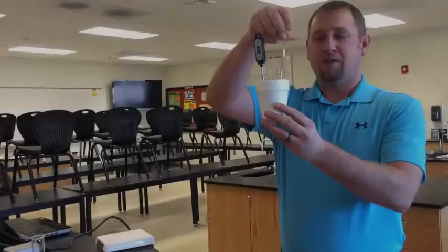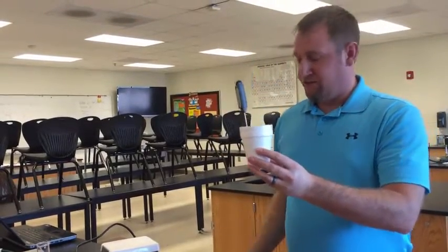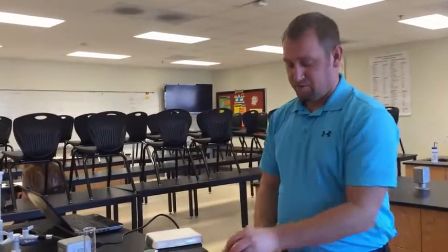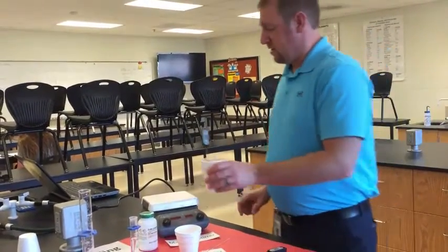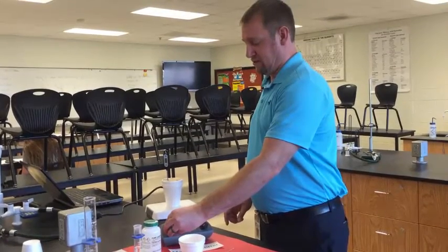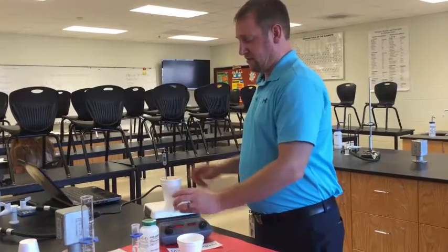Now, there is an alternative method to stirring your calorimeter rather than the old-fashioned stir stick, which we just demonstrated. You can start over using a technique you've learned before: take the magnetic stirrer, put it into the solution, reattach the cardboard top, and add the thermometer — this will stir the solution. You may have to turn it up a few RPMs because it does have to go through two layers of foam.